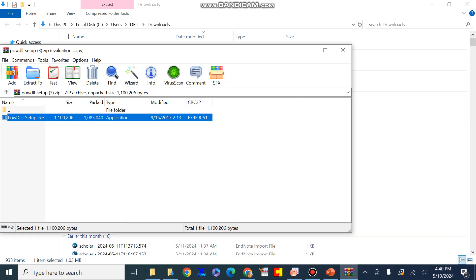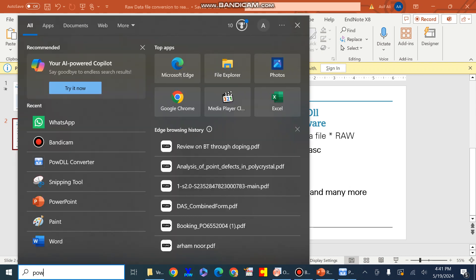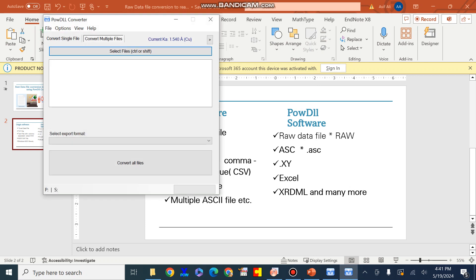Now open the PowDLL software from the Start menu in order to convert the raw data file from one form into another. First I will show you that the .rd file and the raw data file are not in a suitable format for Origin, and we need to convert them into an Excel file or an XRDML file.